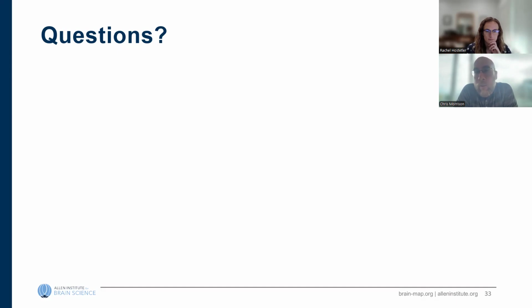Yeah, and additionally, the website I showed. The notebook that I ran through for this webinar is basically a concatenation of several different notebooks. So if you are lost, or there were too many steps in that one, each section that I presented has its own walkthrough, effectively as a notebook on the website.